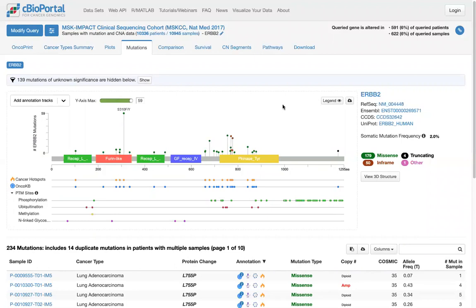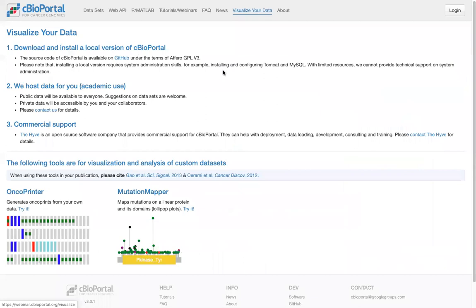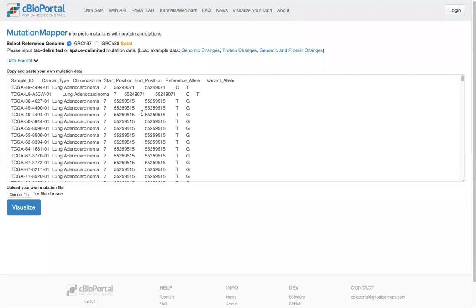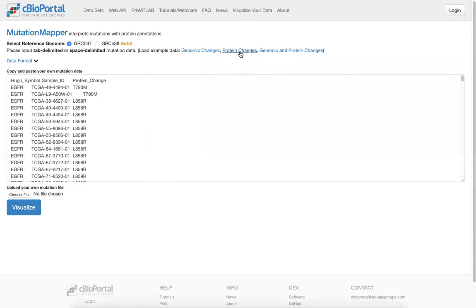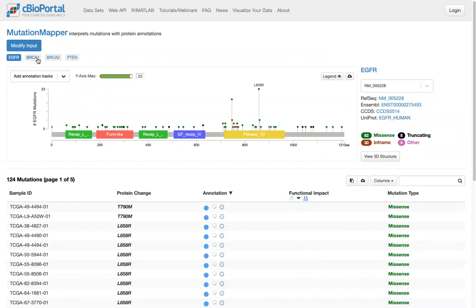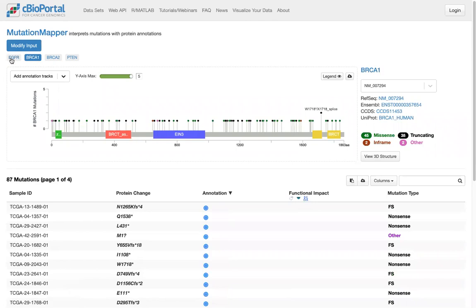The mutation lollipop is only available for data already in cBioPortal, but there is a way to visualize data from other sources. Under the Visualize Your Data page, there's the Mutation Mapper tool. When you click on it, it's a simple interface where you can copy and paste your own mutation data. We support three different formats: genomic changes, protein changes only, or both together. You type in your cases, hit Visualize, and get different lollipops for your genes of interest — with all the same annotation sources as directly in cBioPortal.